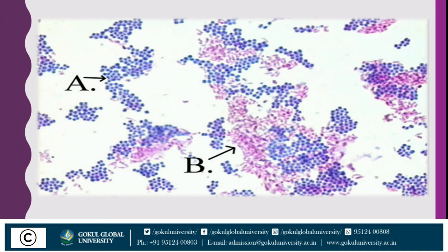This is a microscopic observation. Organism A and organism B can be seen. Organism A is blue in color, meaning it is a non-acid fast organism — it obtained the color of methylene blue, which is an ordinary stain. Organism B is pink in color, meaning it is an acid fast organism — Mycobacterium bovis or Mycobacterium tuberculosis — because it stained with ZNCF dye. So A is a non-acid fast organism and B is an acid fast organism.